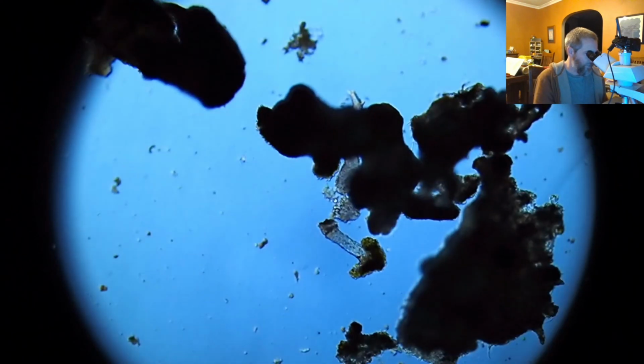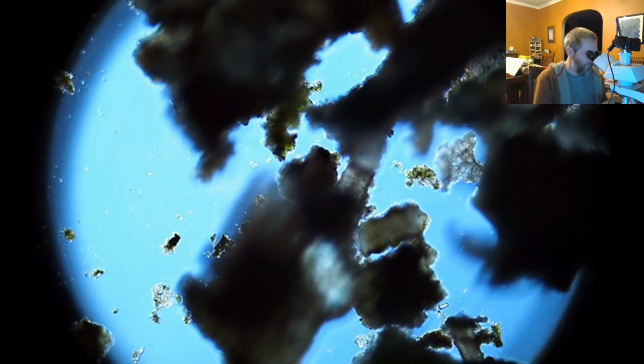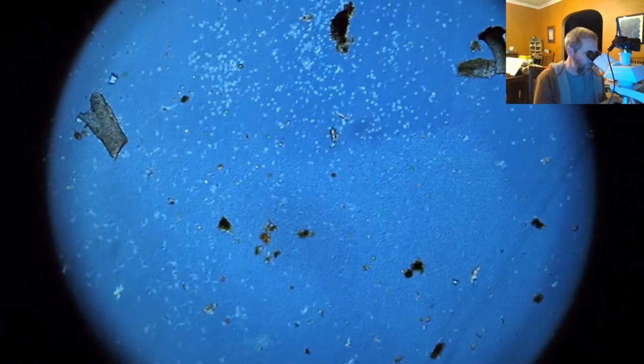Rotifers. Because we kind of looked around the whole slide. It's hard for you to tell, but for me, I kind of know we've moved up and down the whole thing once or twice, and picked out most of the stuff in here that's crawling around. So I've accomplished my goal for the evening, which is basically just to spend a little bit of time looking through the samples and giving people a little bit of view of some of this microscopic world.